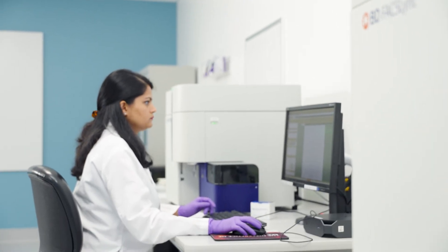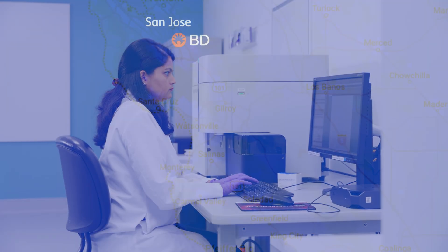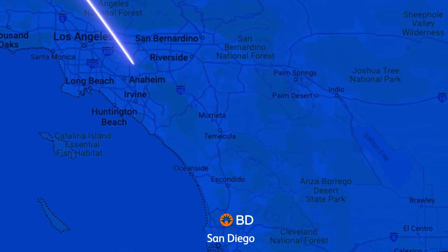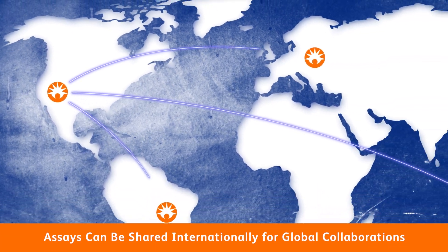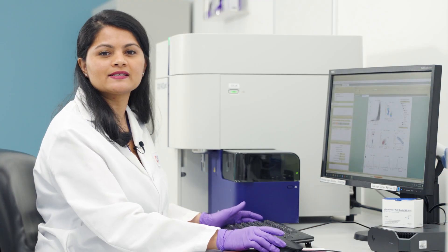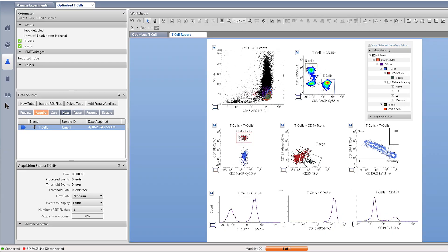For this demonstration, I've optimized a T-cell assay on the FaxLyric at the BD site in San Jose that will be transferred to the BD site in San Diego. I've created a simple T-cell subset assay on one of the Lyrics in my lab. During the optimization, I have already optimized the voltages, the gates, and the plots that I would look at.